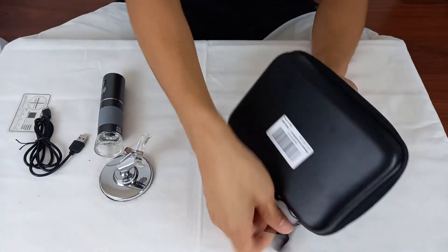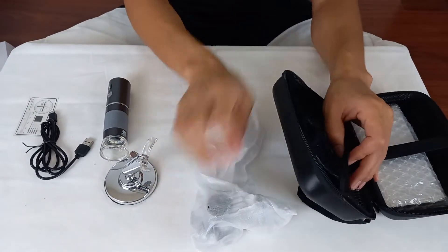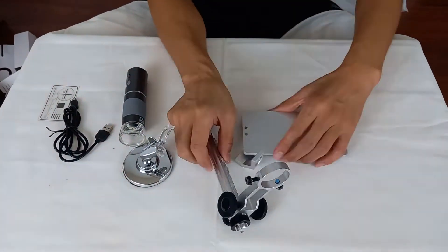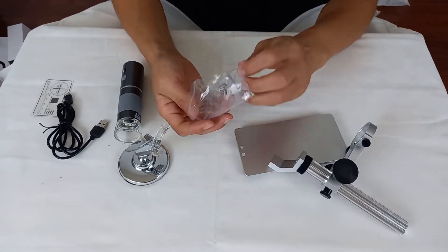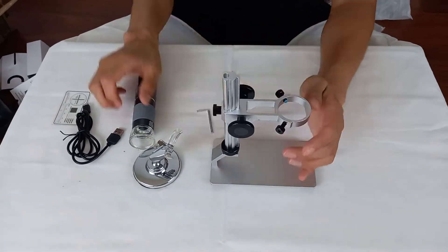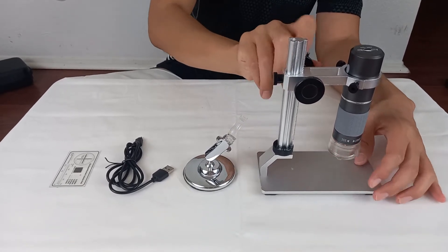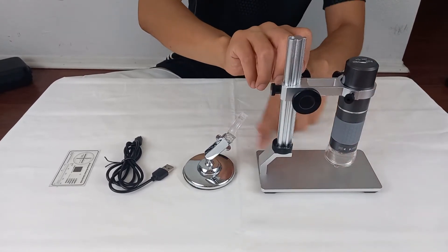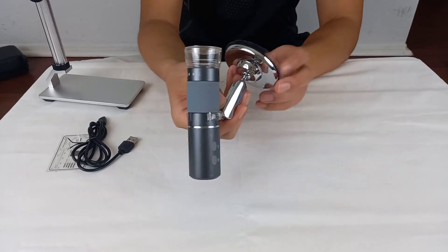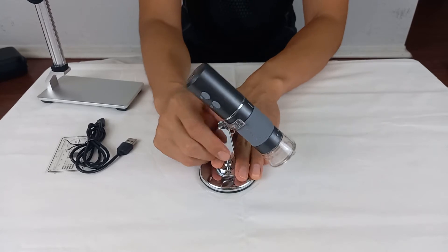This box contains stand parts. Let me assemble it quickly. When I put the microscope in like this, I was able to adjust the height. This stand that came with the microscope is unstable — the microscope falls out too easily. I don't think I'll ever use this.